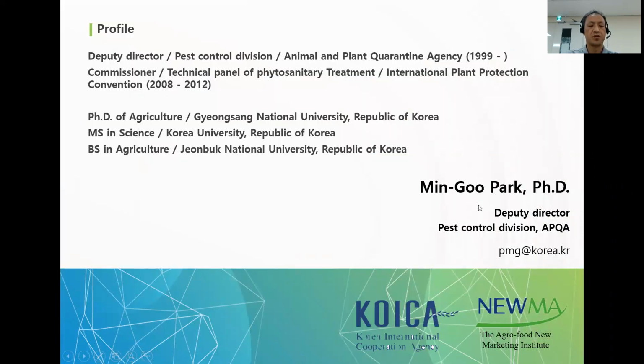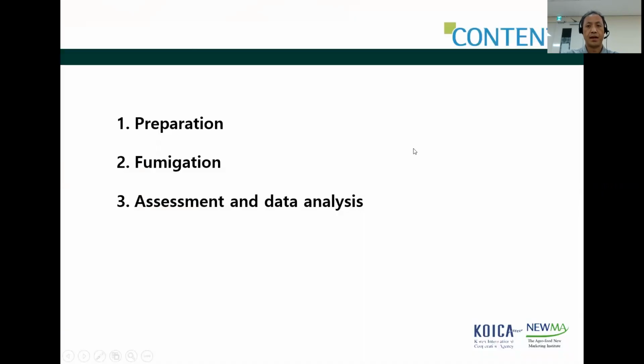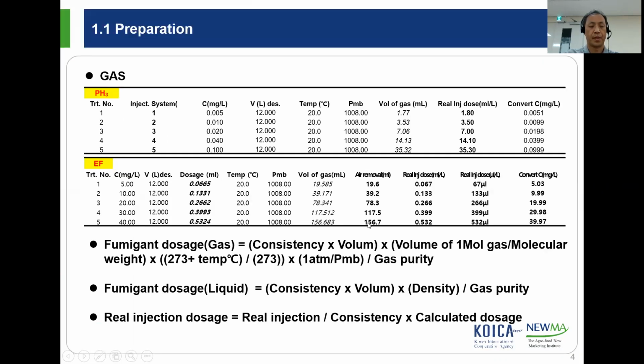I am a team manager of phytosanitary treatment in the pest control division in the Animal and Plant Quarantine Agency. I made the presentation in the following order: preparation, fumigation, and assessment and data analysis. You should make an Excel file for the test.